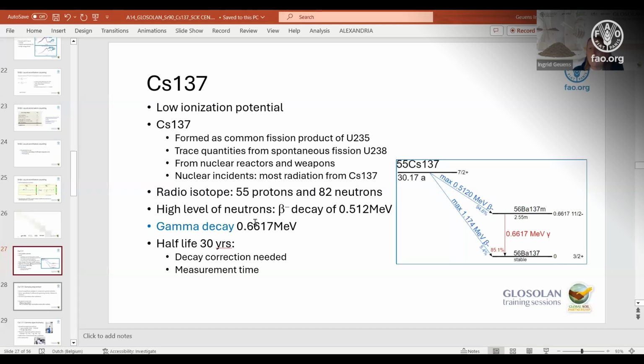If it's too high, and if it's really coming from fission product uranium-235 and uranium-235 still present or uranium-238 still present, then we have to go to hot cells, or at least glove boxes, but most of the time hot cells. However, if you're monitoring soil material, then most of the time you still can work in fume hoods, but we protect ourselves with lead blocks.